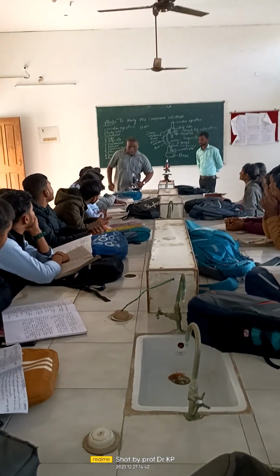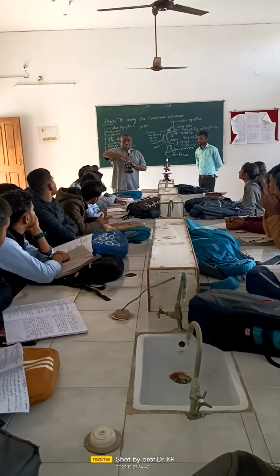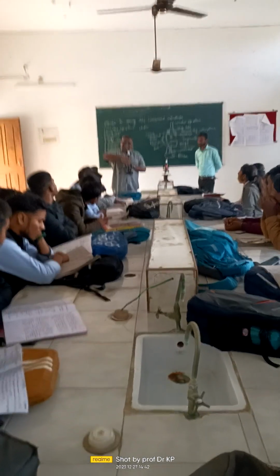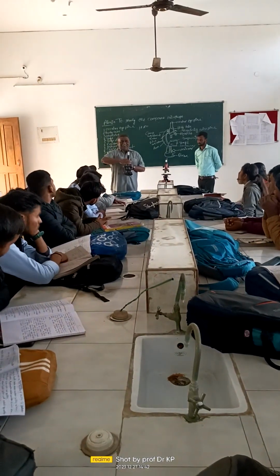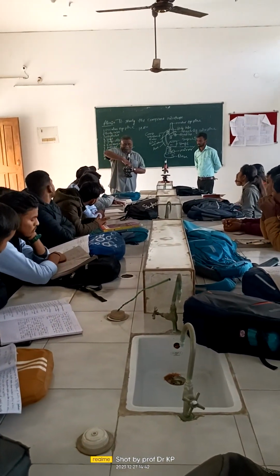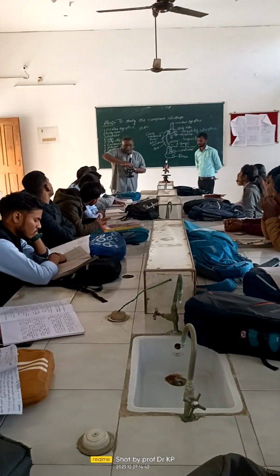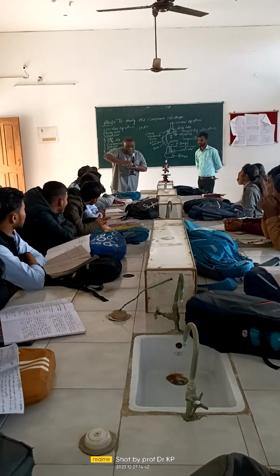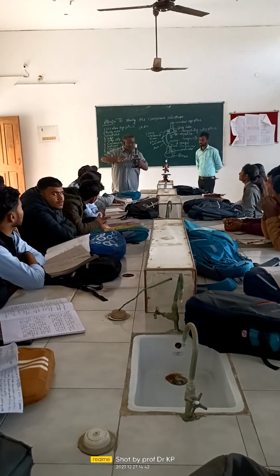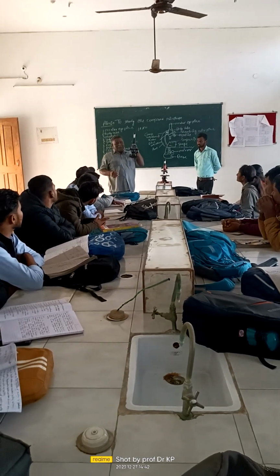The objective lens is rotatable and with a click sound you must confirm whether it is in place or not. For example, now it is in place because it is tight. When you turn the lens like this, next it is not in place. You can hear the click sound. The click sound confirms you have kept the lens in place.